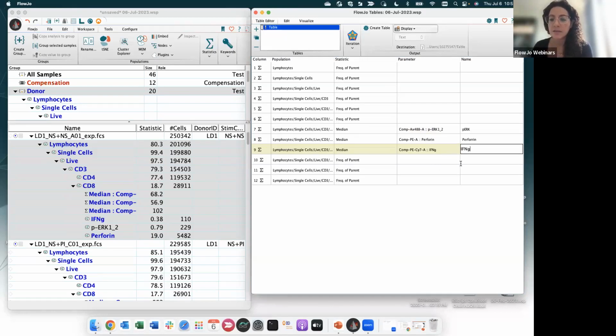Okay, I see there is a question, which is, is it possible to modify a gate for all the same gates in the batch? My advice would be edit the gates. If you have a synchronized group, the gate will be modified automatically, or just edit the gates on the graphical window, apply that to the group, and then recreate the batch. I mean, creating a batch really takes like a few seconds. So it's probably the same time. So my advice is always to do that.